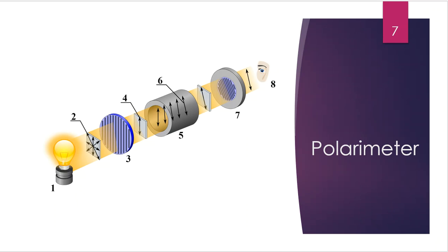So let's talk about each one of these pieces and what they're doing on the inside. That way, when I use a polarimeter in a laboratory, I know exactly what's going on up underneath the cover. By the time I put my sample into the compartment, close the door and hit the big green button, I'll kind of know what's happening there. It makes me a little bit smarter, and more attractive as an employee, because you can talk the lingo and tell them everything that's going on up underneath the hood.